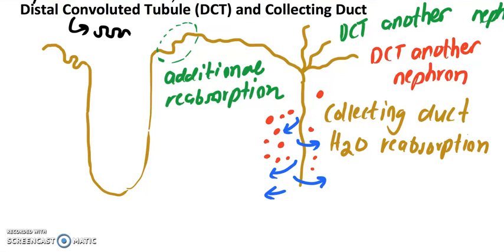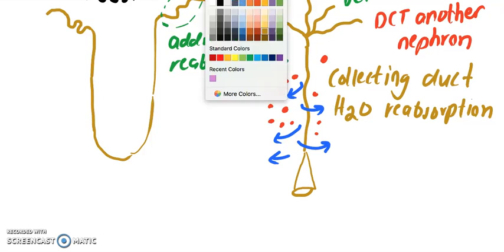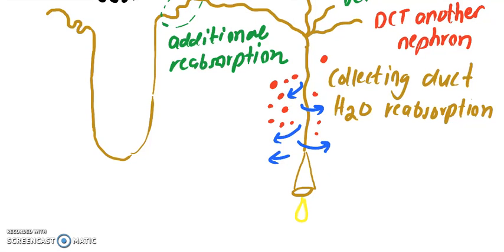This is the third video for the kidney, and we left off at the collecting duct. At the end of this point, once we have taken what we've needed, this is kind of the point of no return. Let me try to create a tube here. Now at this point, we can be considered urine, or we have drops of urine being produced.